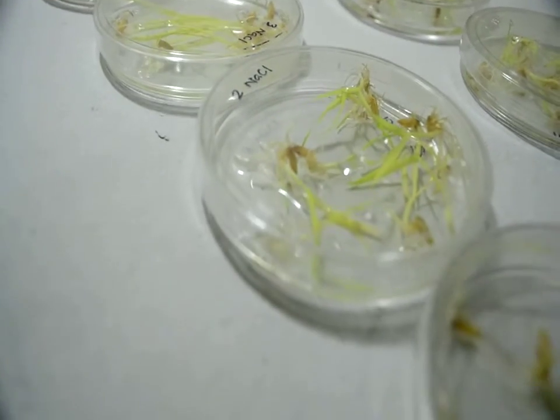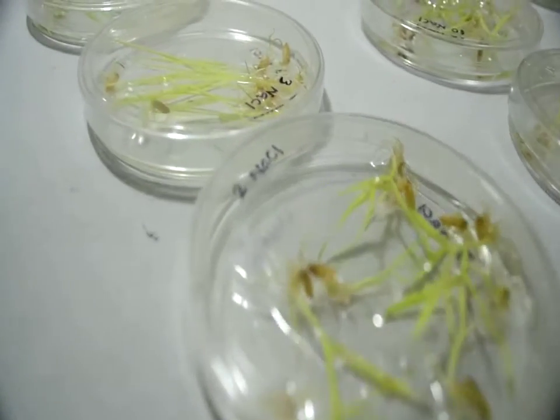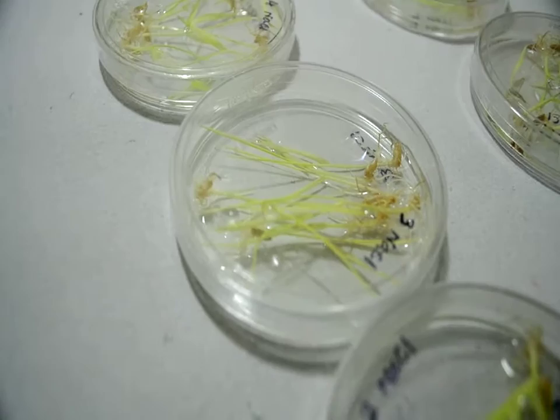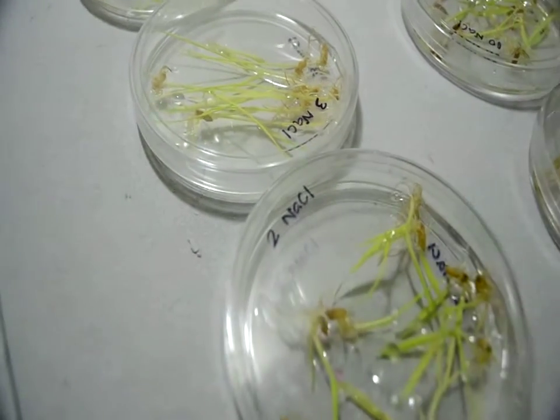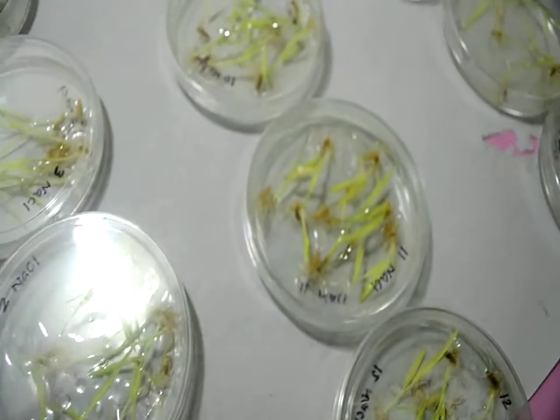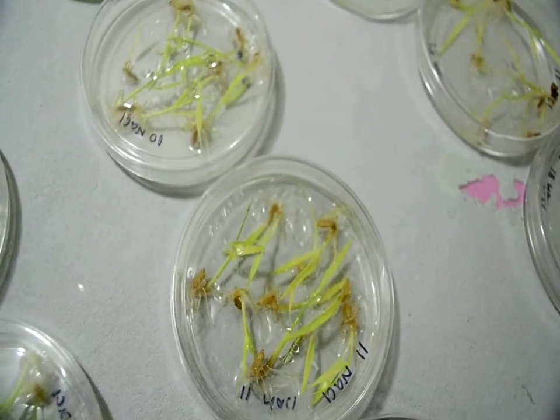The petri plate method is the easiest method to germinate seedlings, and they can grow up to a week or ten days without any external nutrient supply, using the nutrient reserve in the seeds for emergence.